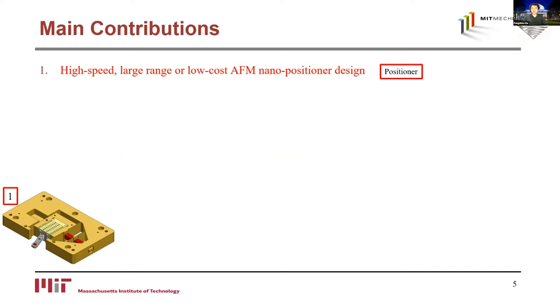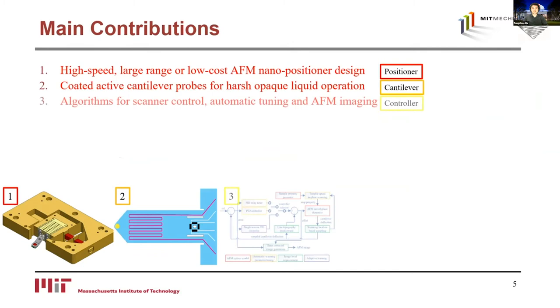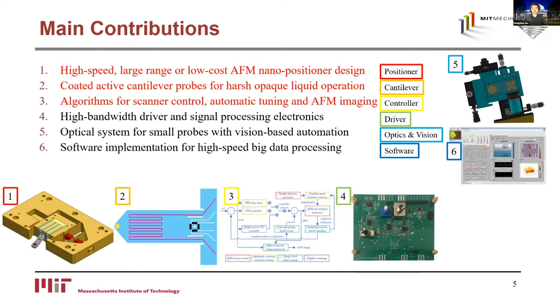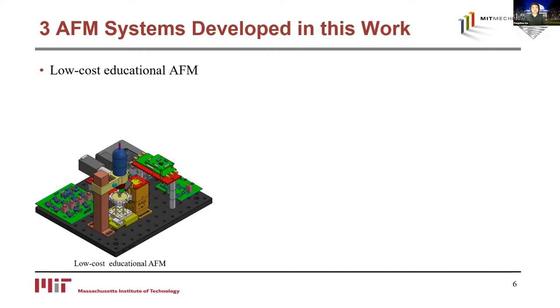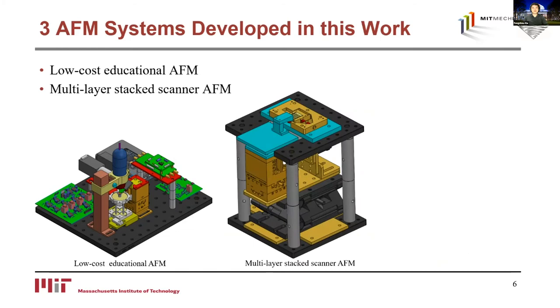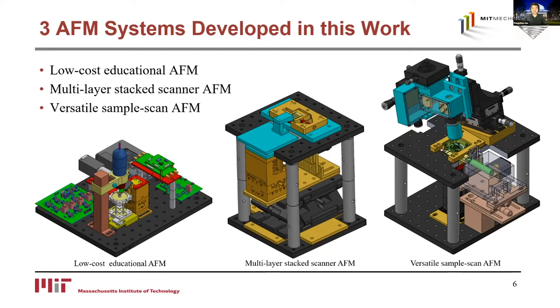There are a total of seven contributions. The first is the high-speed, large-range, or low-cost AFM nano-positioning design — key to enabling high-speed and large-range imaging. The second is coated active cantilever probes for harsh opaque liquid operation. The third is algorithms for scanner control, automatic tuning, and AFM imaging. The last we'll focus on is AFM system integration for visualization — explaining how we put this together. This slide shows simplified CAD designs of the three AFM systems: the low-cost educational AFM on the left, the multi-layer stack scanner AFM in the middle, and the versatile pile sample scan AFM on the right.